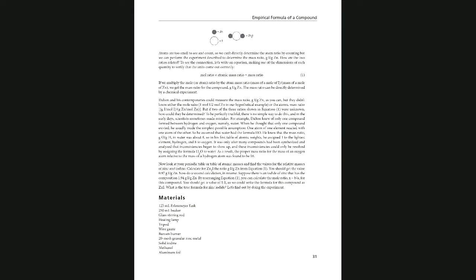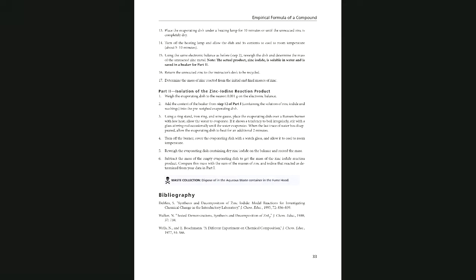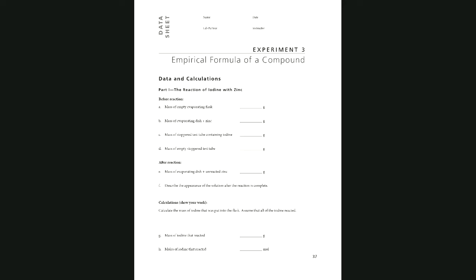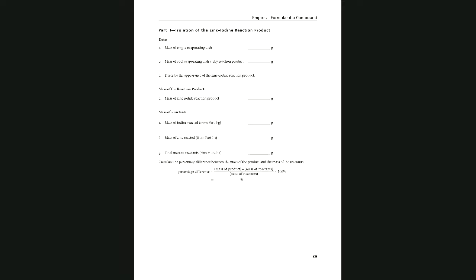Make sure to study the first 3 pages in order to be able to answer the pre-lab questions and perform the experiment, or watch the experiment to collect your data, and then you will turn in your pre-lab and your data sheet after you complete using the instructions and the data collected for today's lab as a result of today's lab. Okay, I'm going to start with the procedure for the experiment.